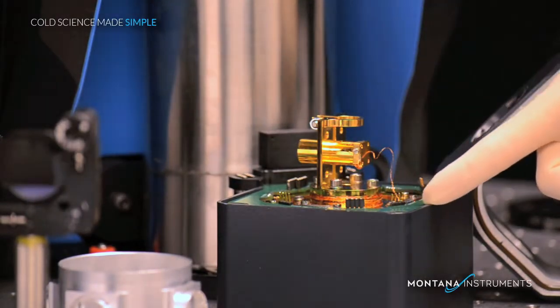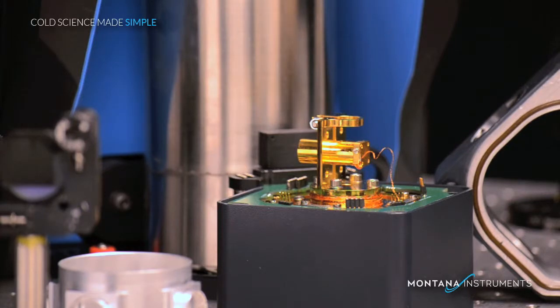Notice the electrical connectors. There are 29 electrical connections right into the sample area, and also easy to use thermal lagging locations for all of the wire.